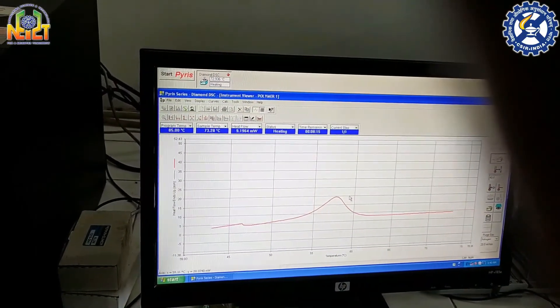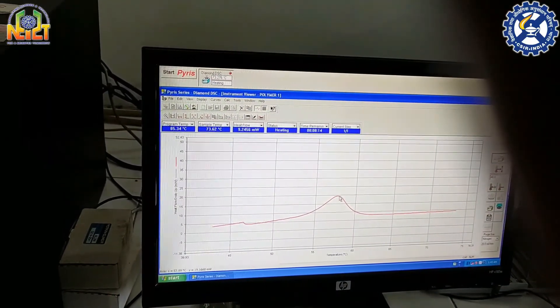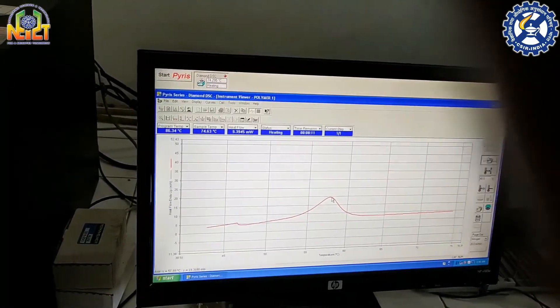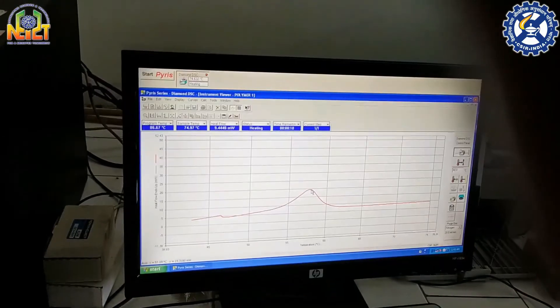This is the crystallization point of our polymer sample.